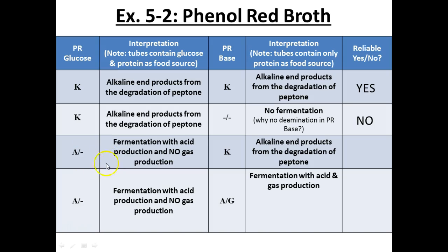Given sugar and protein, they ferment it, no gas production. Given the choice of just protein, they eat the protein. Is this a reliable result? Yes.